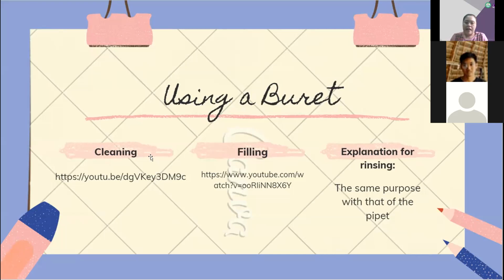Okay, and then after having the warm soapy water, i-rinse na naman natin siya ulit ng distilled water. Pag hindi na kaya, we use the brush. Meron tayong tinatawag na burette brush. It looks like the test tube brush na meron tayo pero mahaba lang siya since mahaba yung burette natin.